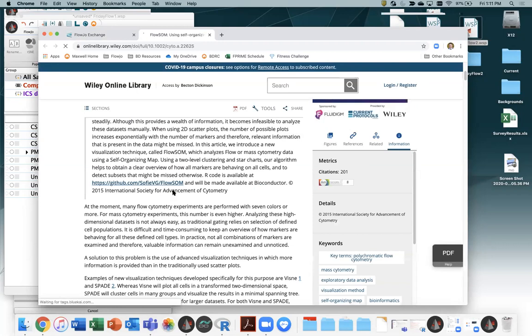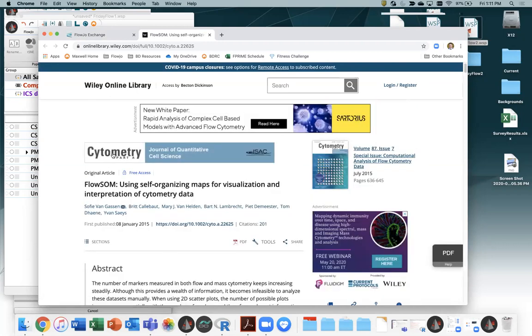And so most of those tools, most of those papers, if you're interested in the tool, are available just from one click at the spot where you might be going to download the tool anyway. All right, closing that up.